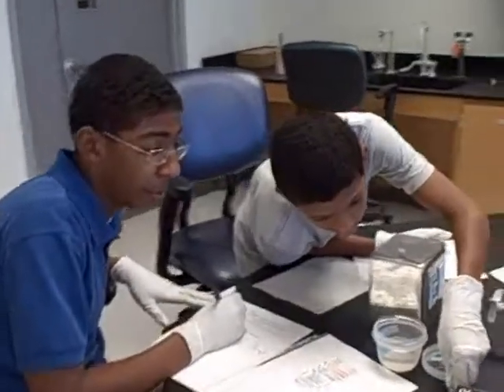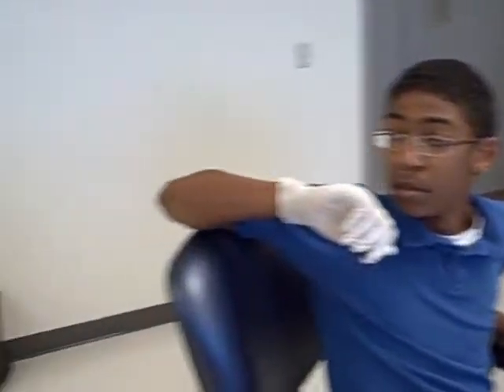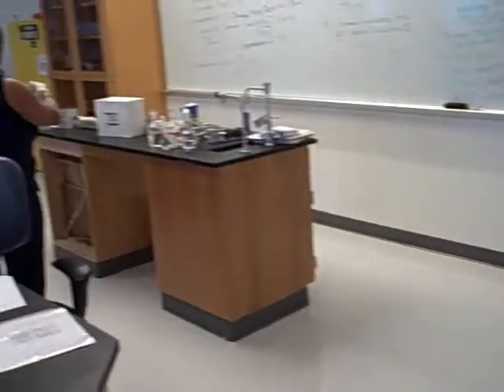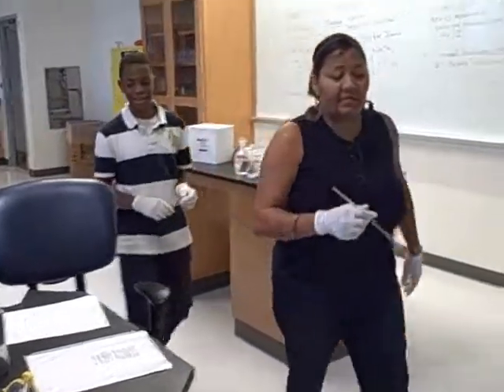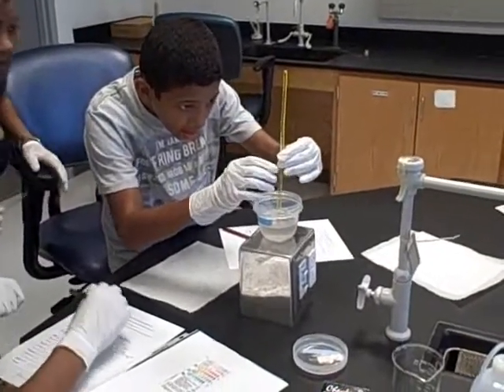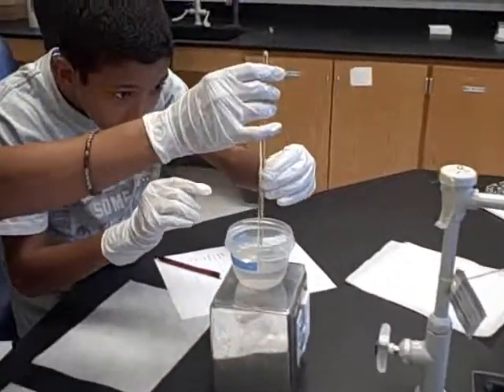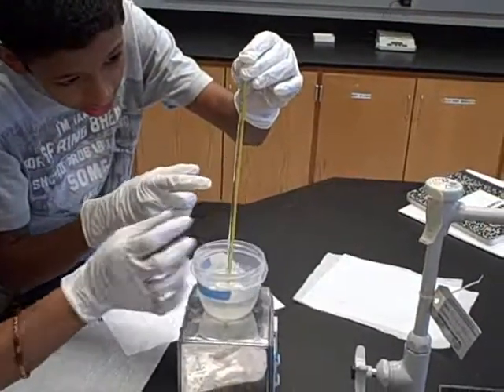So far, does anybody have a temperature reading? What do you get? 19 degrees what? Okay, no, you don't think. Go get that thermometer and read it. Let me see for sure. No, we have to know. Scientists are very exact. Is that the line right there? Yes, sir. Hold your hand up here so that your hand doesn't warm it up. Put that there. Okay, look. Now turn it this way.